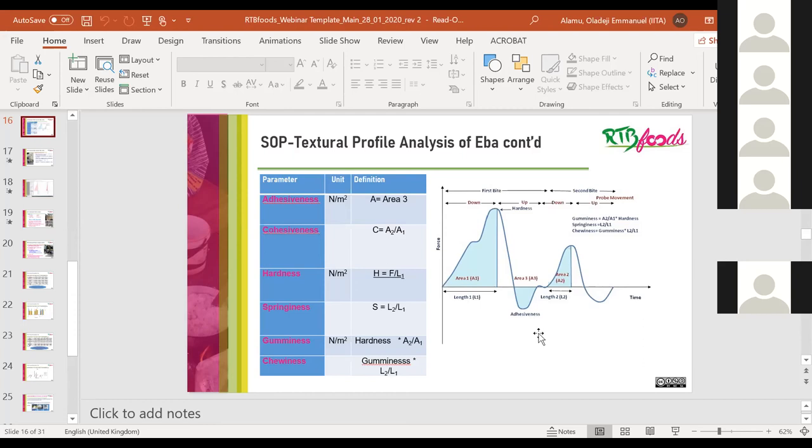So this is another suggestion for this PMU. Now we look at Gari on its own because it's being consumed as a product, and the characteristics of the product of drinking Gari is different from the characteristics of Gari making a dough. So what we are thinking is we try in the lab, as Jim has asked, to collect spectral data, but we have not used it because in work packet 3, we think that spectral data on the final product, because all the structures have been destroyed, may not give us more information, but we really focus on the raw root, which is the fresh material, as well as intermediate product. But we will discuss in work packet 3, and we did not move towards having spectral data on the final product.